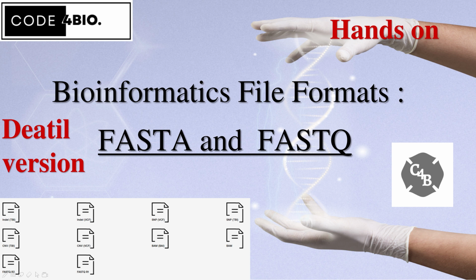Today we're diving into the fascinating world of bioinformatics file formats. Now, you might be wondering, why should I care about file formats in biology? Well, my friend, let me tell you, this is one of the most crucial aspects of modern research and data analysis in the biological sciences. So, buckle up and get ready to have your mind blown.